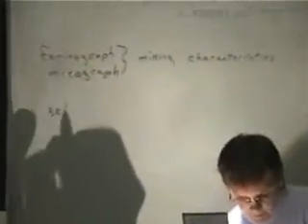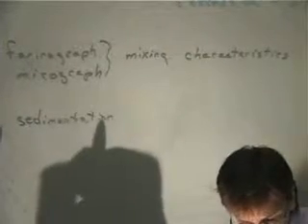And for the farinograph, we were talking about the 500 line. You're not going to go into these details, that if it gets off the graph, you have to put extra weight and all that stuff. The farinograph, I'm targeting 500. The curve needs to be centered on the 500 line.